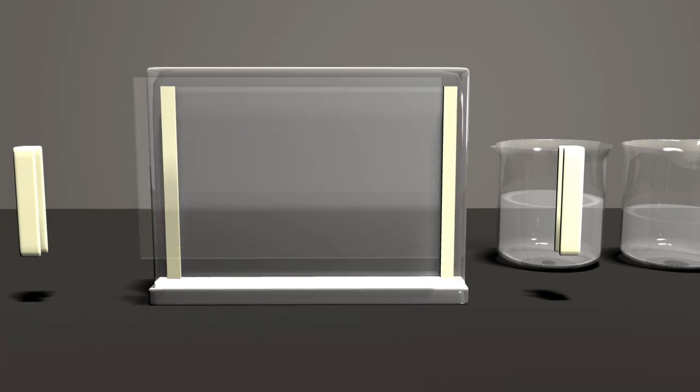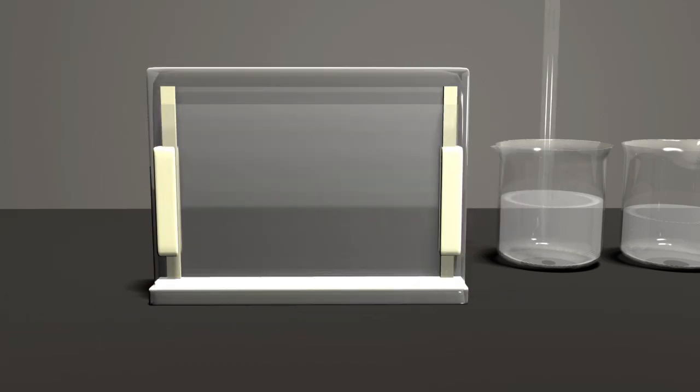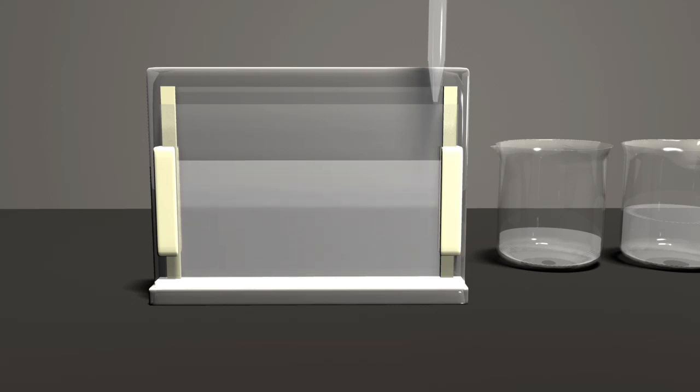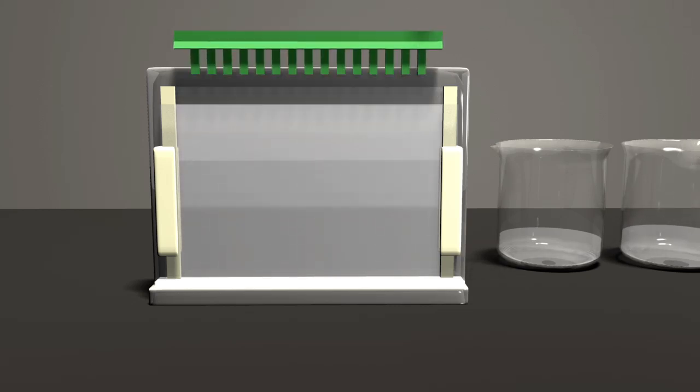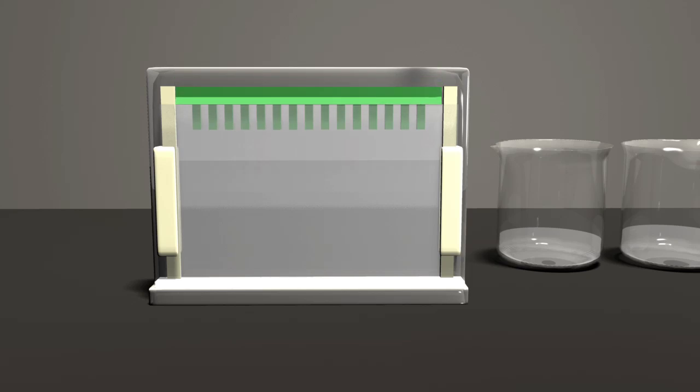In PAGE, the gel solution containing the acrylamide compounds, catalyst and polymerizing agent is prepared and quickly poured between two plates anchored vertically in a cassette. A small plastic comb is placed at the top to create wells where the protein lysates can be loaded. As the liquid solution hardens, a flexible, thin gel forms between the glass plates.